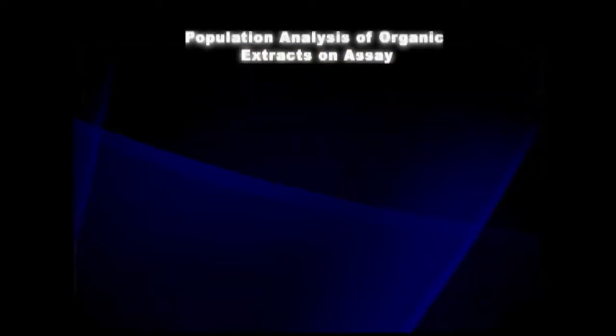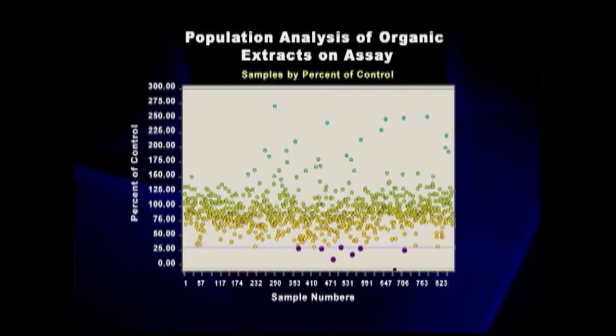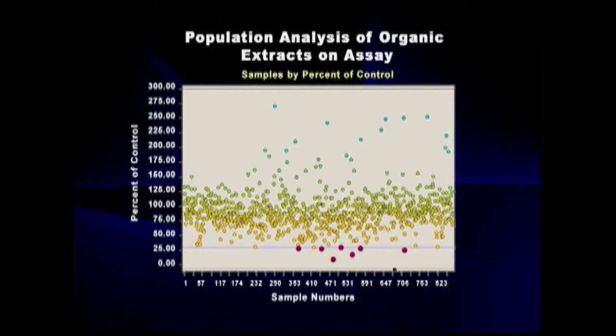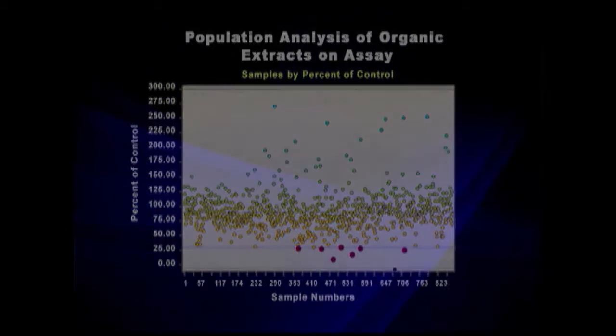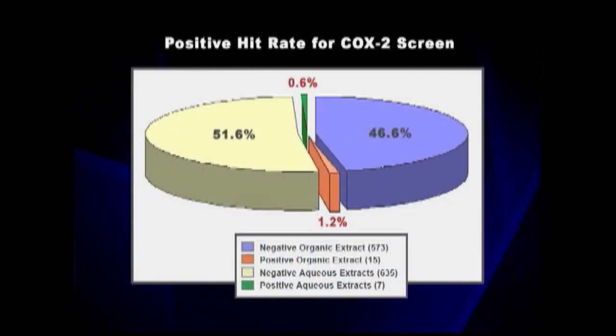After we developed and validated the model, we put all our extract libraries through it, and you get a distribution population of hits. In most cases you will see a 0.5% or 1% total hit rate. Those hit compounds are taken out to run a dose response curve and validate the hit, and then each hit extract is fractionated into 88 fractions.